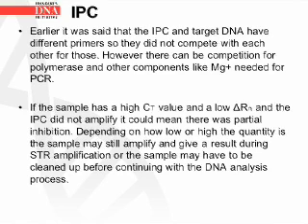If the sample has a high CT value and a low delta Rn, and the IPC did not amplify, it could mean there was partial inhibition. Depending on how low or high the quantity is, the sample may still amplify and give a result during STR amplification, or the sample may have to be cleaned up before continuing with the DNA analysis process.